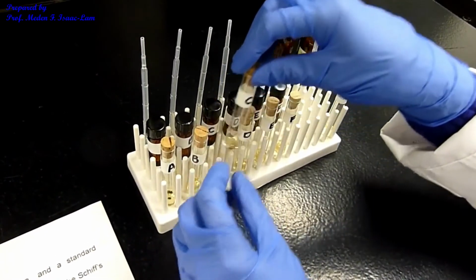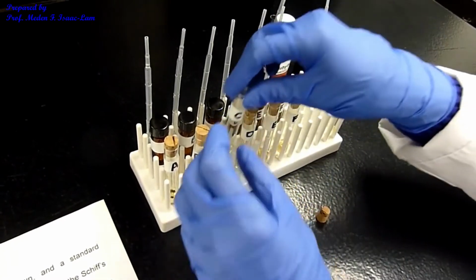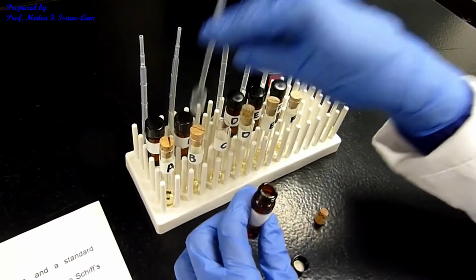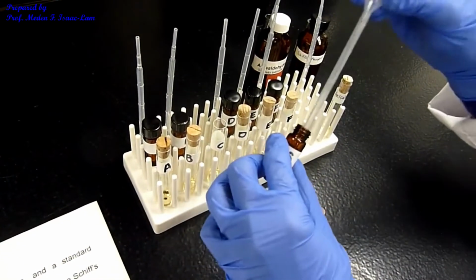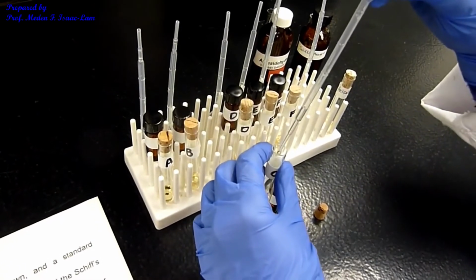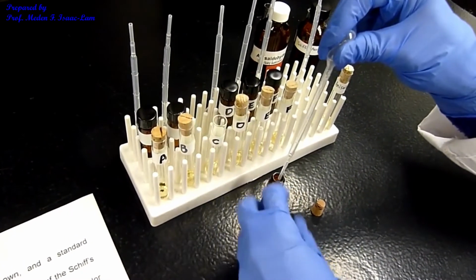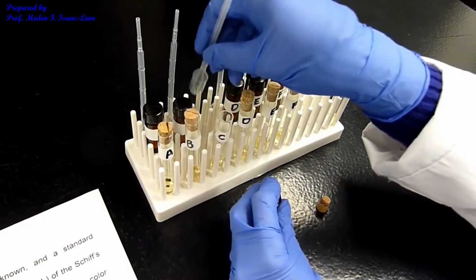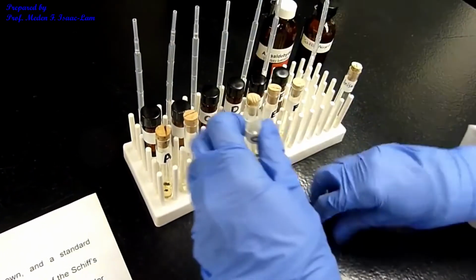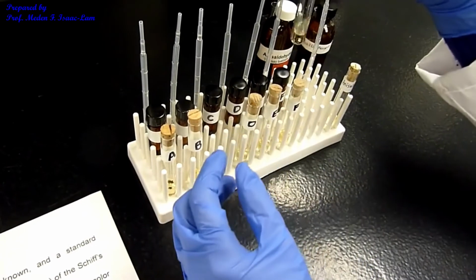And then unknown C. One drop again. And then shake.